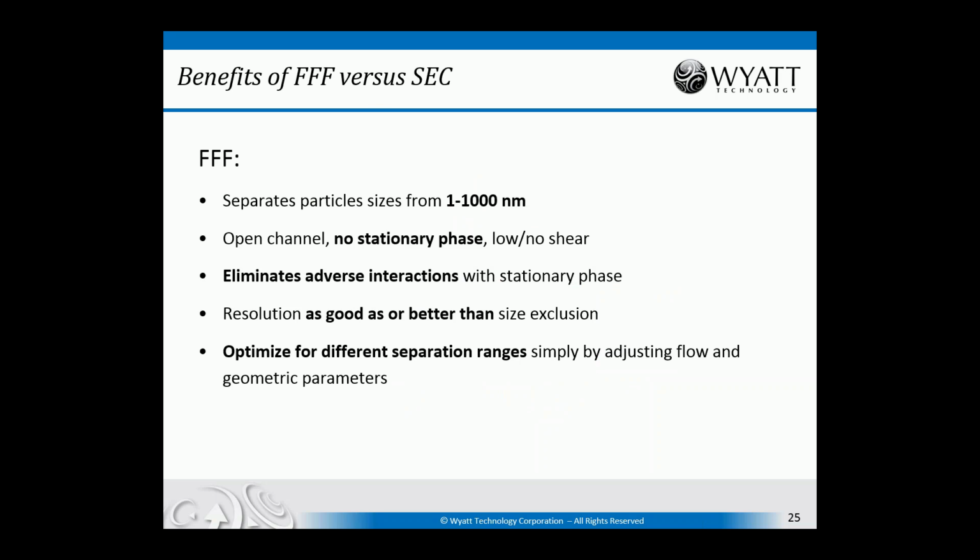So as I mentioned, FFF is a very versatile technique and can separate sizes from 1 to 1,000 nanometers. It works in an open channel with no stationary phase, and therefore there is essentially no shear, and it is very gentle on the analyte. Because there is so much less surface available for interaction in terms of stationary phase, most of the adverse interactions with surfaces are eliminated. The resolution is as good as or better than standard size exclusion.